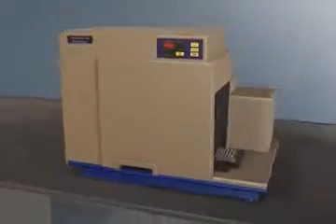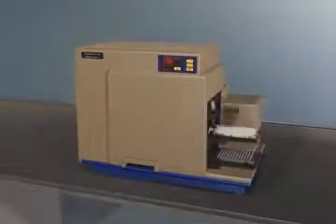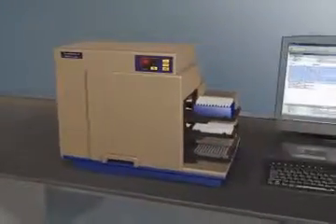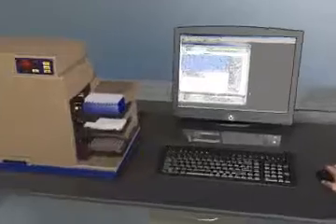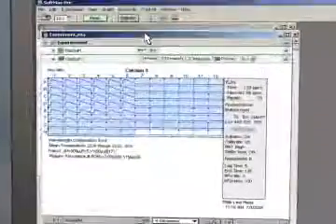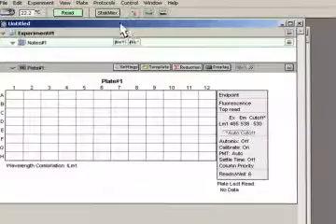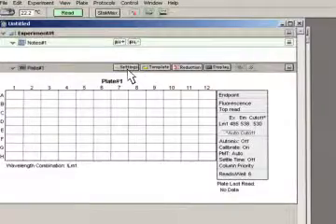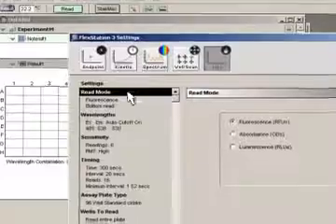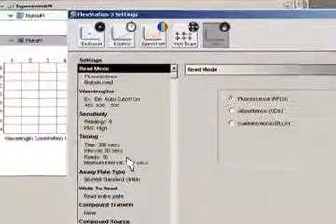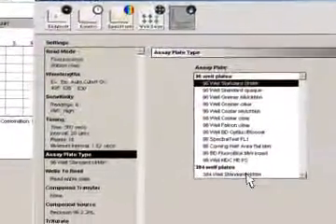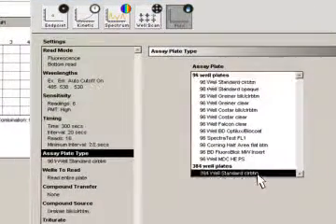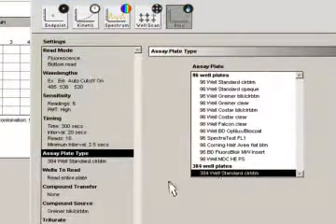The FlexStation 3 system is controlled through Softmax Pro software. With our convenient pre-configured assay protocols, it only takes a few mouse clicks to select the appropriate settings for your assay, such as plate format and the optimal fluid transfer parameters for your application.